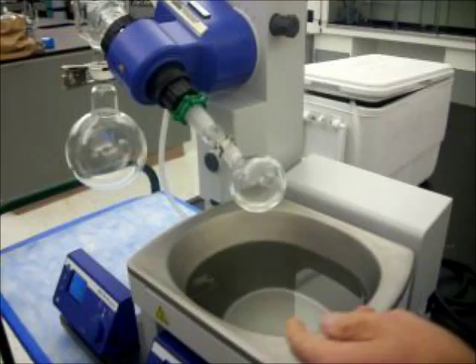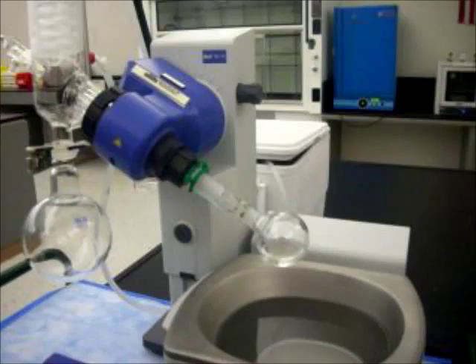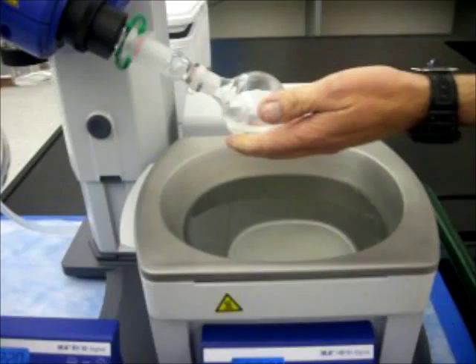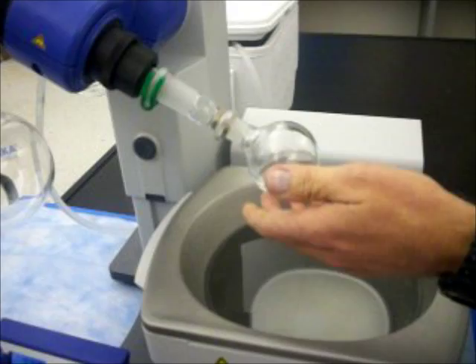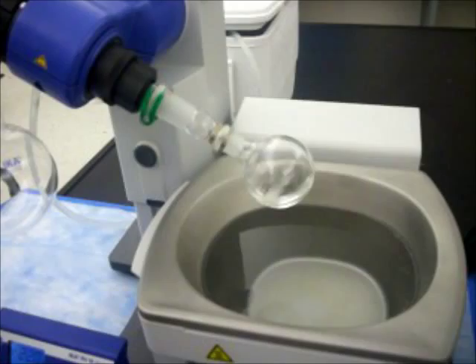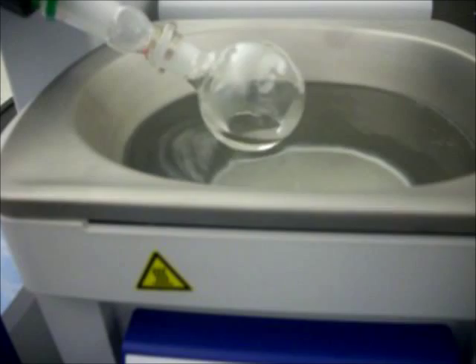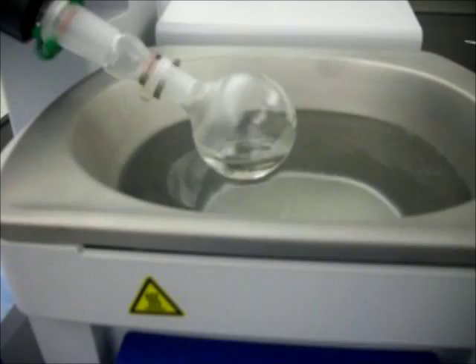And probably want to speed it up so it's going at a good clip. That's nice. Is that too fast? No, it's good. Just so it starts, just dipping in the water. Because that's pretty hot water, it might go crazy. That's good. It's starting to condense on the other side? Not quite yet.